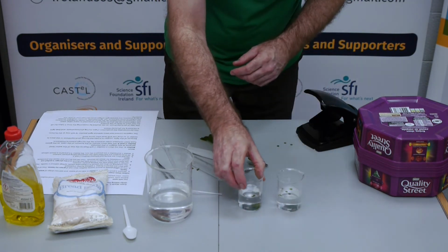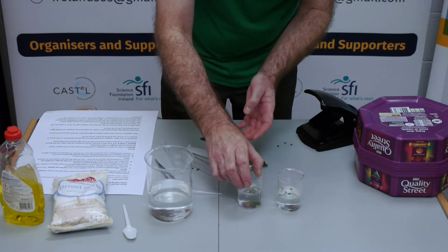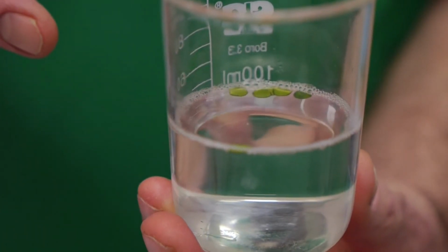Over time, what you'll see happening is that the gases in these leaf discs will build up as oxygen is produced during photosynthesis, and it'll cause the leaf discs to rise. So the result of this experiment shows a couple of things. First of all, that gases are produced by leaves during photosynthesis, that there are gases produced in the stomata. The discs that aren't treated, that don't have the gases removed, float from the beginning. The discs that have the gases removed but are then placed in the dark will not float, because there's no light available for them, so they can't photosynthesize, so there's no gas production.